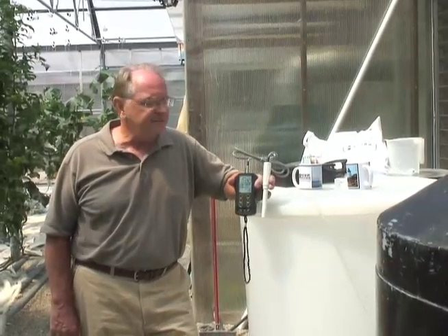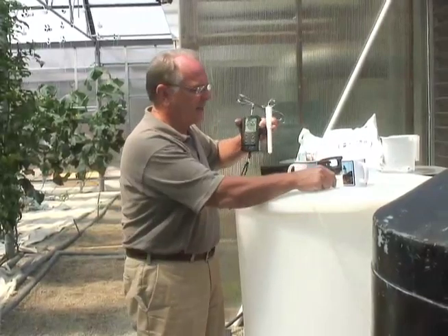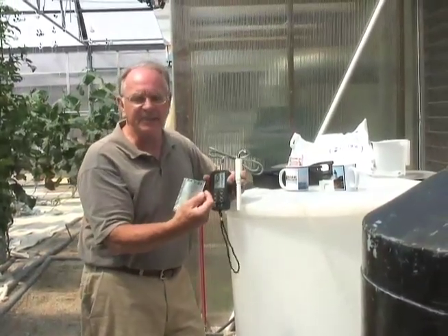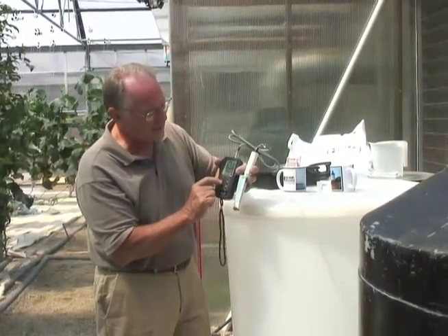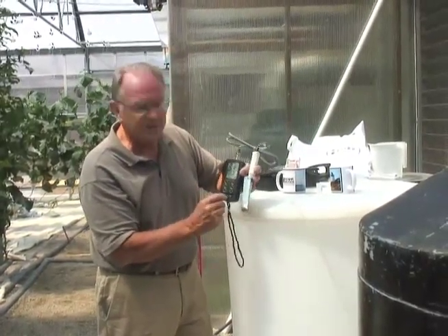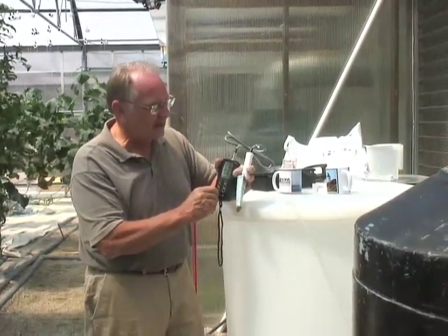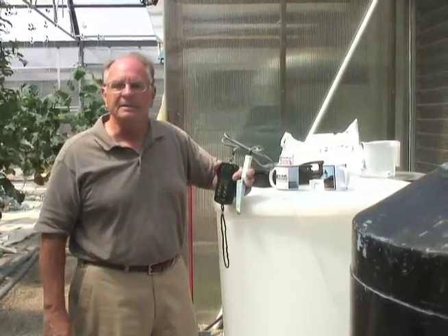To calibrate, we take the tip off and stick it in a known calibration solution. This is a pH 7 solution. We put it in the pH 7, switch it to pH mode, and then turn our dials to reset it. And that's how easy it is to calibrate this meter for pH.